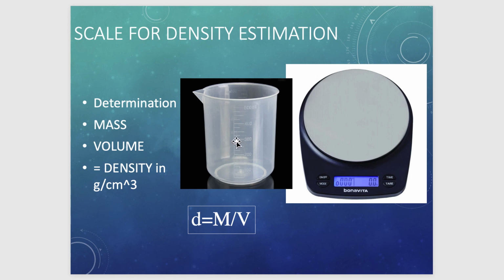But remember, you have to calculate the difference when you do that. So by immersion, you will see the change in volume, and that is what should sit underneath this ratio. So that's an approach that is quite commonly helpful, because we can rank our minerals by density. So we'll be in a position in which we can differentiate, for example, sulfides and oxides from silicates.